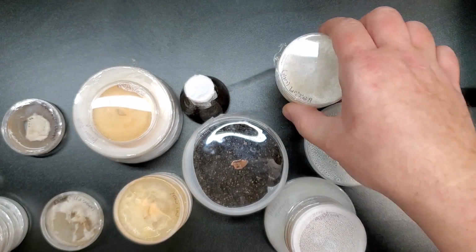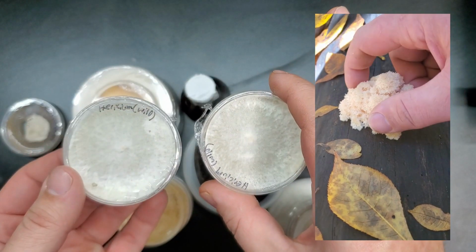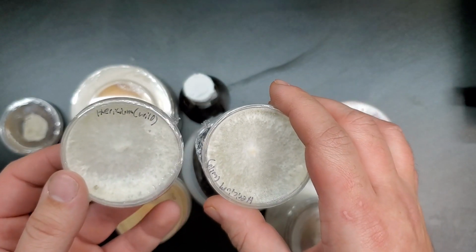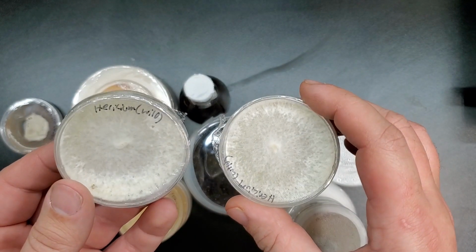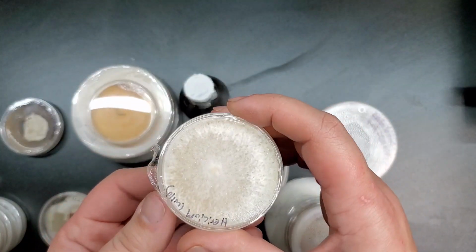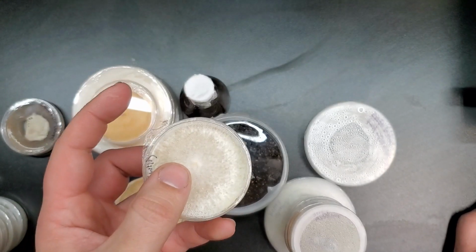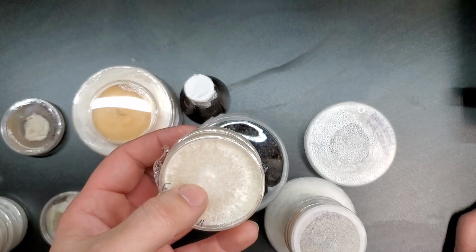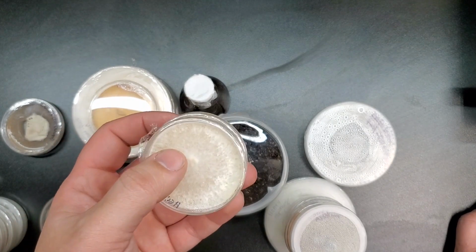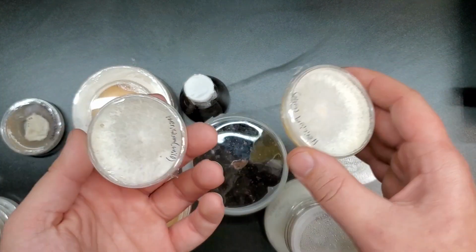And here in this little corner, we have 2 of the Hericium petri dishes that I took from that Hericium. I'm almost fairly sure that was a bear's head tooth mushroom that I found. Yeah, these are 2 of the really beautiful culture plates that turned out absolutely perfectly from that tissue sample. I started out with 4. Now I have these 2 because I used the other 2 to inoculate some sawdust, and I'm just letting that colonize right now to see what happens. But I kept these just to have in my culture collection, and probably once the weather gets a little bit warmer, I will use these to make more culture plates, more petri dishes.